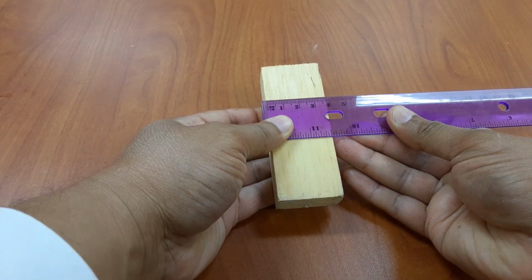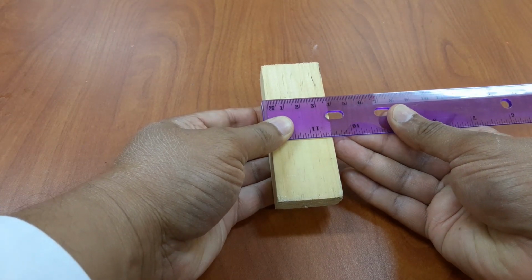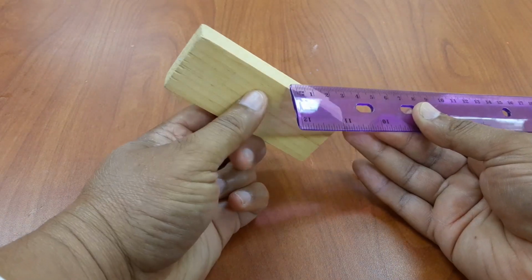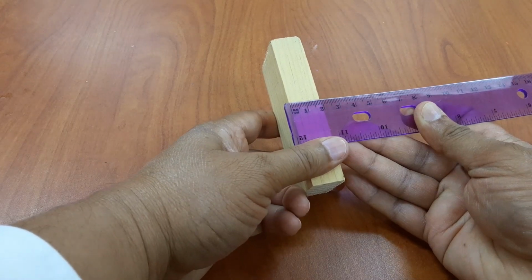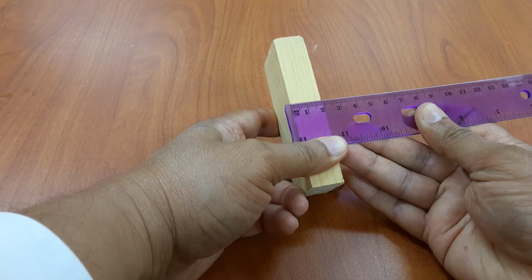The width is 3.7 centimeters. And now we also want to find the thickness or the height of this piece of wood, and the height is 2.0 centimeters.